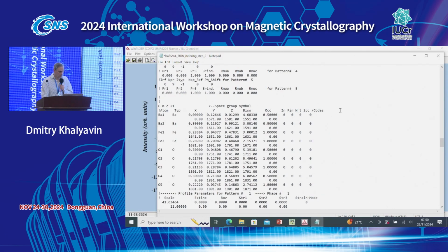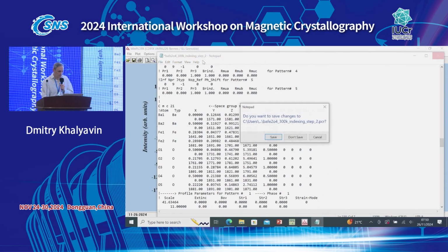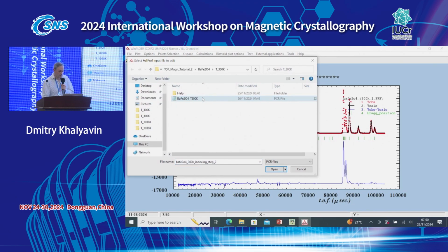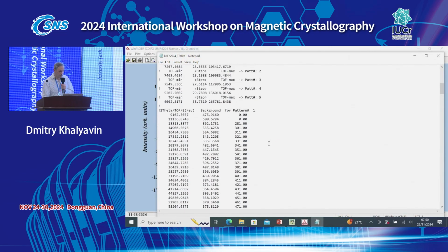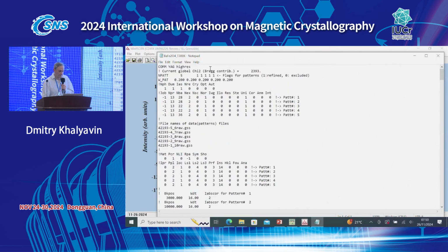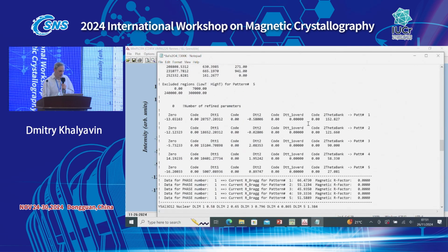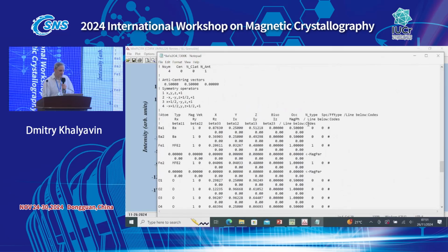No, sorry, I'm using the wrong PCR, because that one which I showed you is what you need to copy. So let's just delete it. So we need this one. Yeah, this one. So let's do again 1. And let's give some start, because usually the program doesn't like when we start refining parameters from 0. So we need to give some finite values to them.